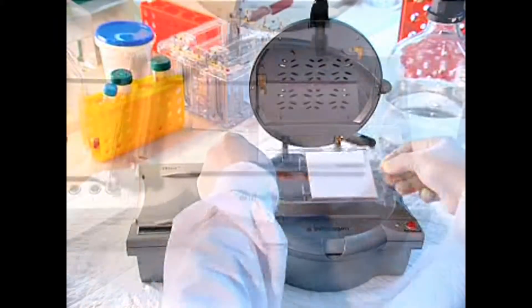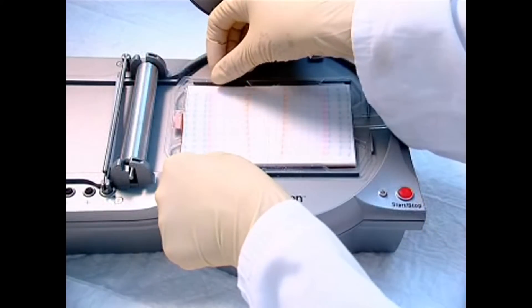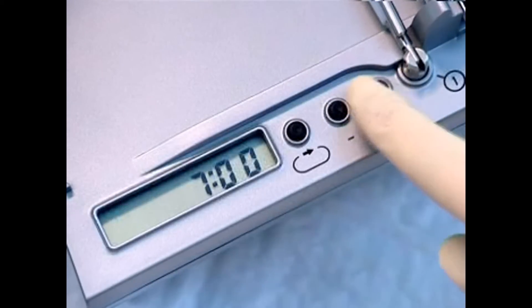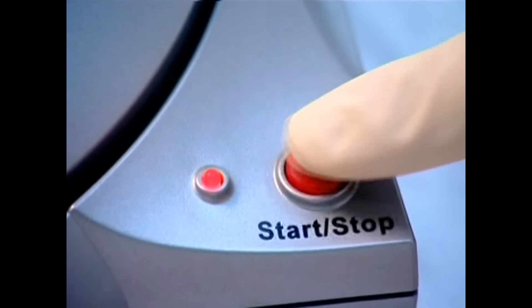The iBlot system transfers proteins from mini or midi size gels, even two at a time. The different run programs and precise time control help optimize transfer of every sample and protein size.